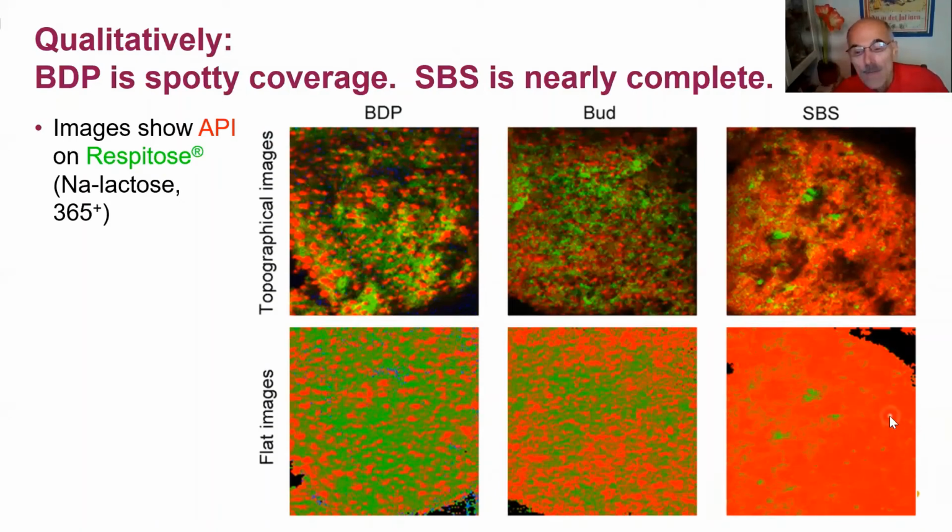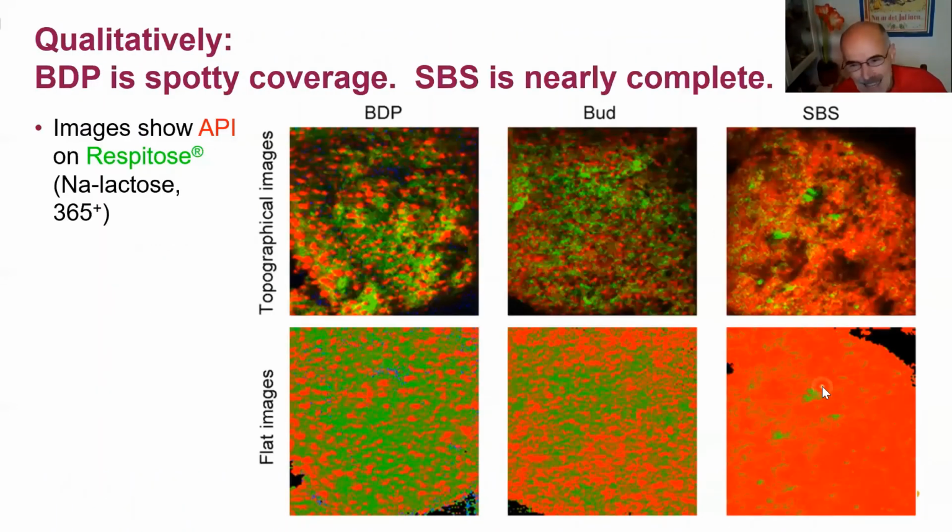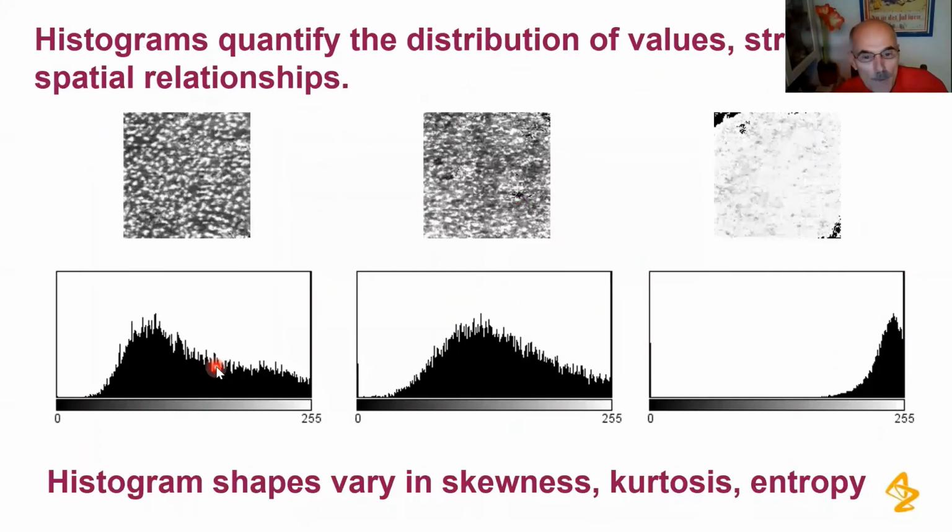So very high levels of coating. The difference between these up here and these down here is that these are showing the topographical variation that you get in total signal in SIMS, and this is normalizing away that topographical variation. We can look at quantifying the spatial resolution. I already said we can see the changes in the composition, and we can quantify that the same way we did with the coating agents, but we can also quantify something about the homogeneity.